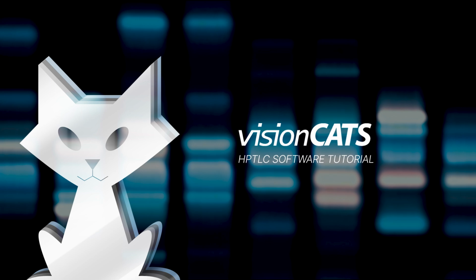Welcome! In this tutorial, we will show you how to use labeling and measurement tools in visionCATS to enhance visualization and support detailed evaluation of chromatographic data.